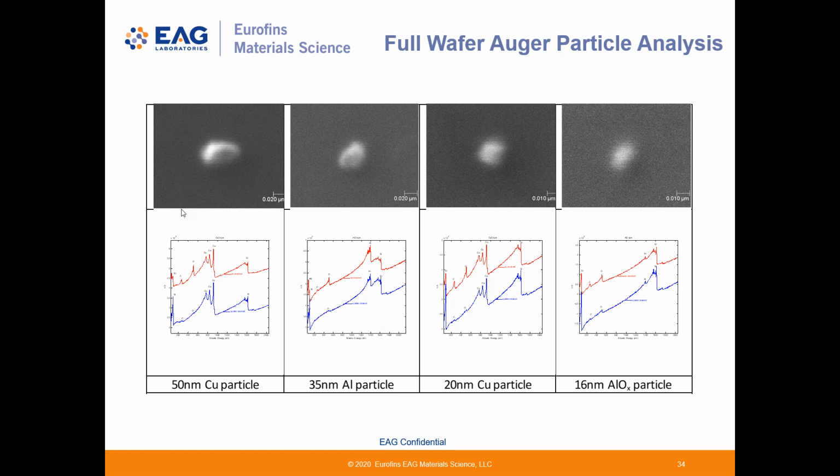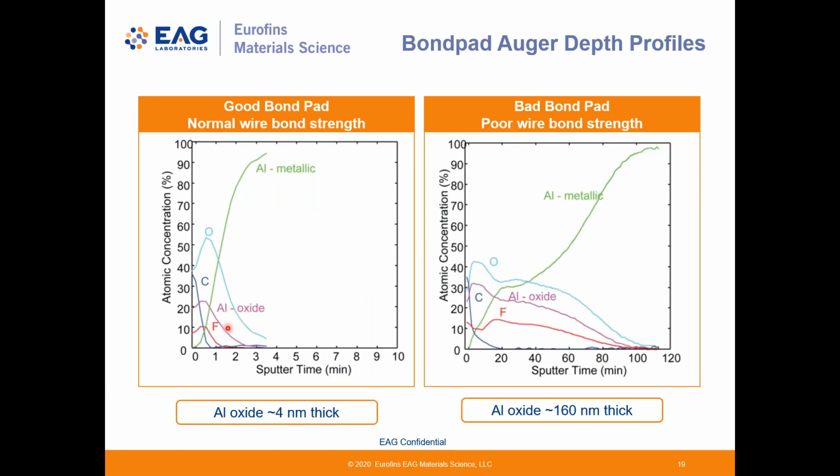I don't have an example of that to show, I don't think, but yes, we do see changes in the line shape, particularly for aluminum, where we had that depth profile, which I showed, two different forms of aluminum, so we can tell definitely the oxidation of aluminum. But in this case, it's just fully oxidized. We really can't tell, for example, iron oxide, if there's ferric oxide or ferrous oxide like XPS can do. So we cannot determine individual oxidation states, but we can typically see whether a metal is oxidized or not.